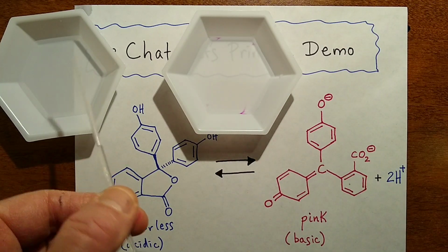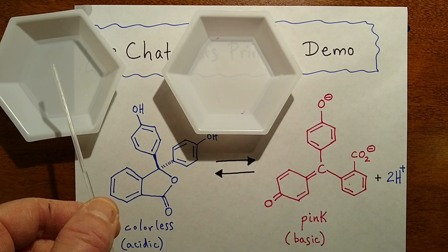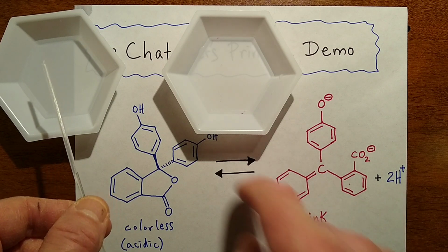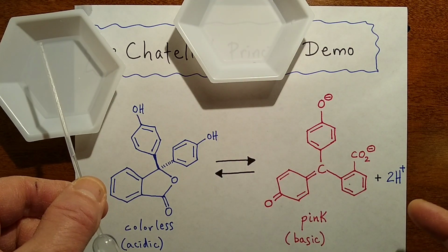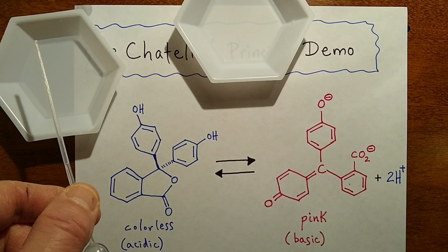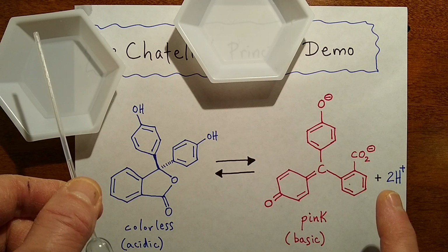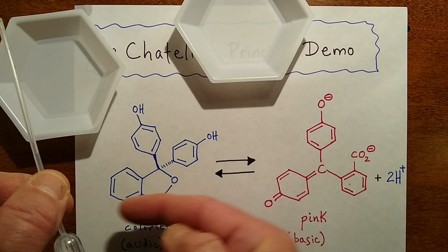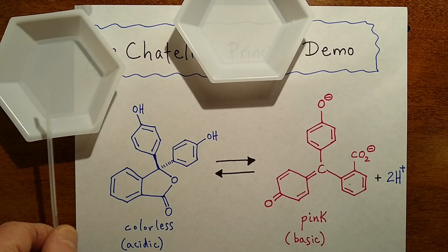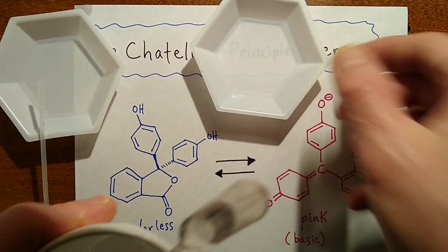What happened there? This solution over here is acidic. It's a source of hydrogen ions. So by adding in hydrogen ions, I've caused the equilibrium to shift to the left. That's Le Chatelier's principle. If I cause a stress on an equilibrium, the equilibrium will shift away from that stress. So it's shifting away from the stress, going to this form, which is colorless. And I can go back and forth forever. I'll just do it one more time.